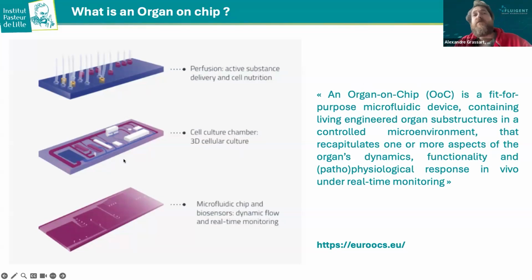So basically you have three major components. One is the microfluidic interface. The second one is the cell culture chamber where you can grow your organoids or tissue. And the third interface might include biosensors or offer opportunities to observe by microscopy the tissue that is grown within these chips.